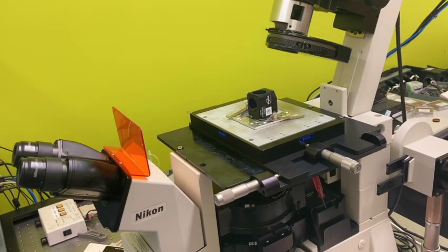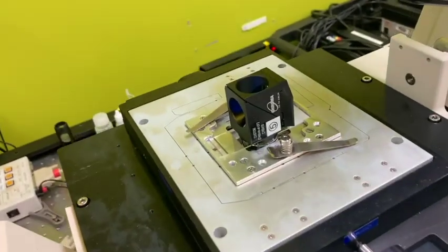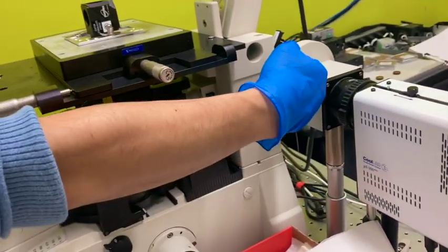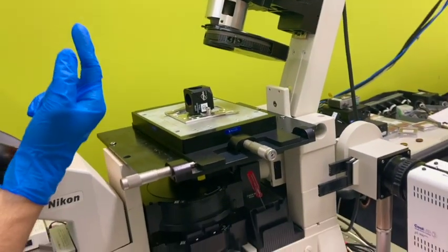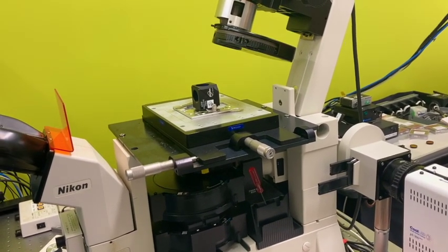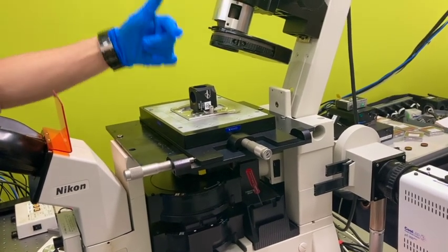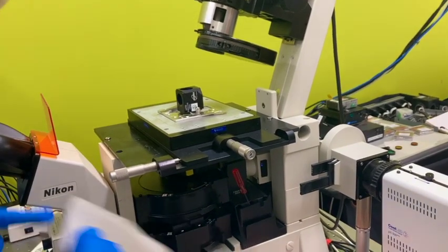So what's going to happen here is I have a line of different wavelengths coming, hit this way and reflect up, and this is actually a combination of blue and green. So this is a dichroic mirror, which by definition will reflect the short wavelength and transmit the longer wavelength. And I think I have a piece of paper here.